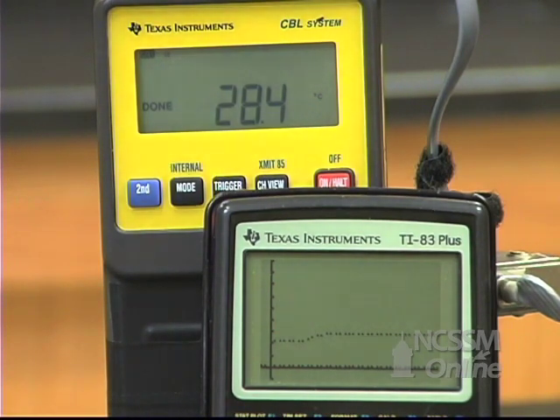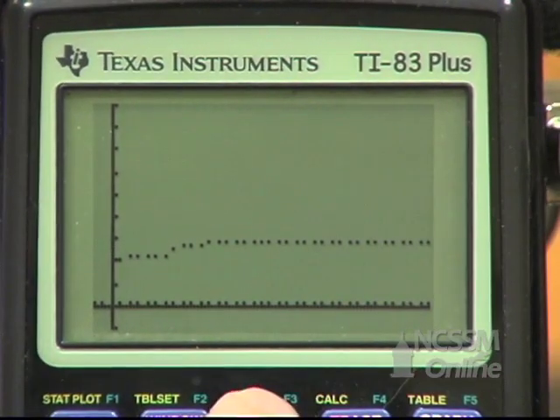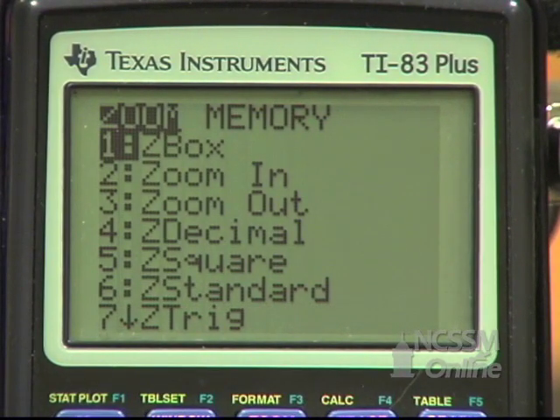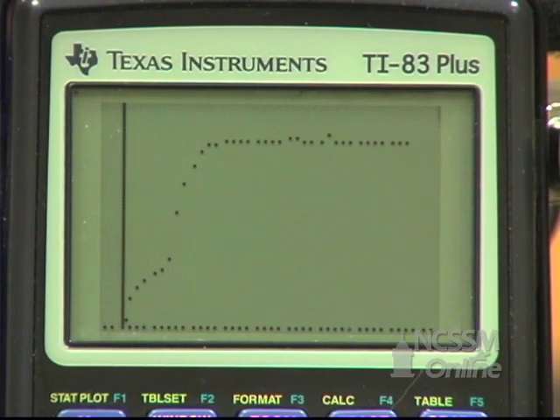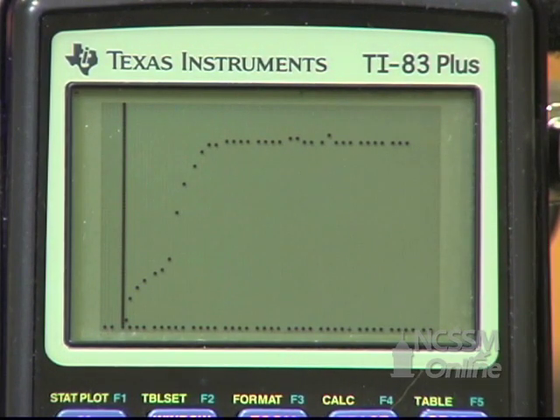When the CBL says done, press zoom on the calculator and number 9 to auto scale the graph to your data.